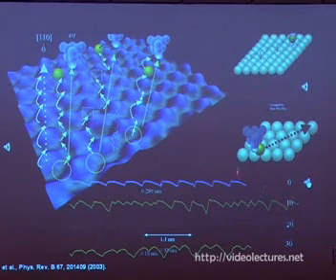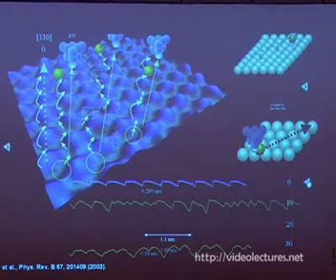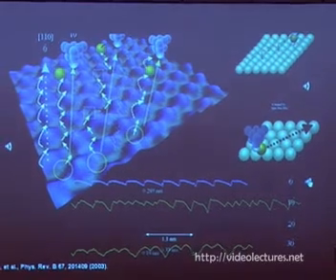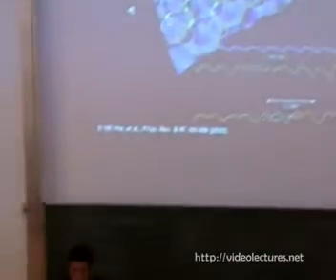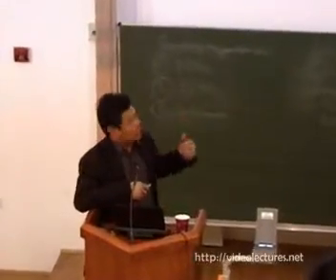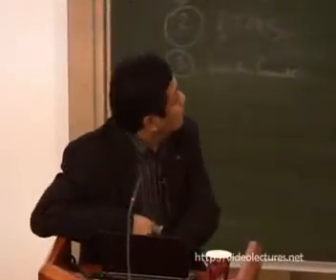So this is the atom movement along the 30 degrees, okay? So we can actually generate this kind of sounds. In my lab, we have these generations, and when we move the atoms, the students are listening to the sound, so we know that the atom is moving along these directions, or which directions, roughly speaking, not exactly 100%, but this helps a lot of things.